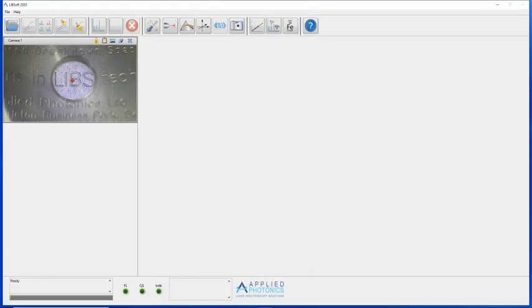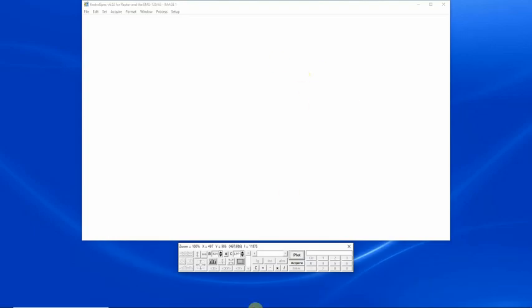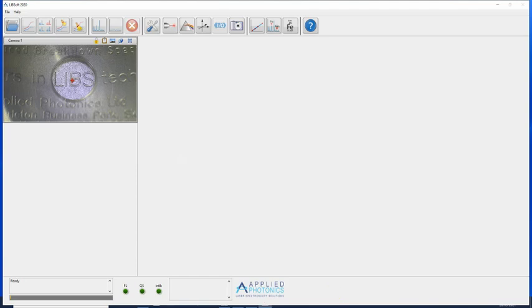A shortcut button to open the spectrometer configuration window, this one here, will be enabled if a spectrometer is connected to the system and has been successfully detected and initialized by Libsoft. For the EMU spectrometer, this requires that the Catalina Scientific Kestrel spec application is also running in the background, as shown here. A separate video describes how to run Kestrel spec for this purpose.